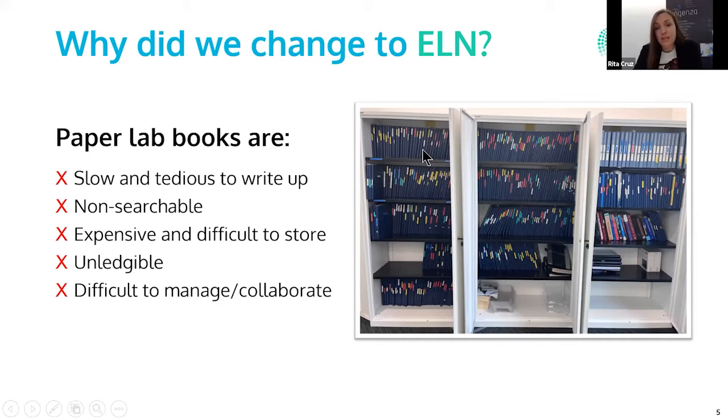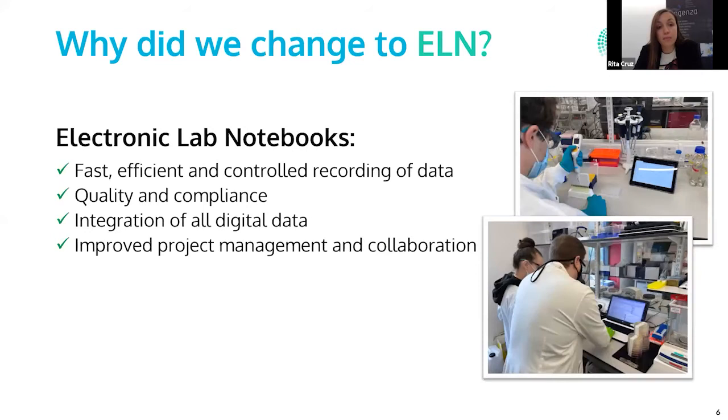So this was very outdated. So for us, it wasn't really a question if we should move to an electronic system, but when and which one. This is obviously because electronic lab notebooks in general promote fast and efficient and controlled recording of data. Also, because the provider has usually done some work in advance to show that they're compliant to several systems. This is already done by the provider, and we don't need to convince or gather evidence to convince our customer that we use a system that has quality and compliance.